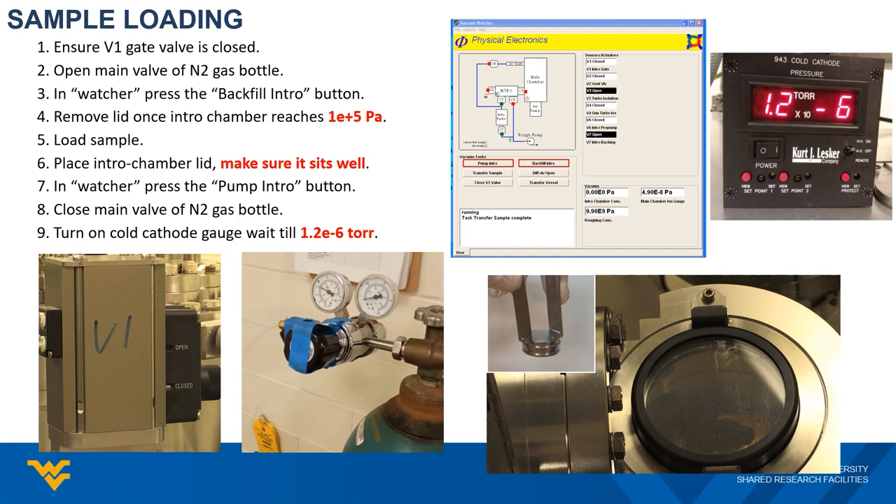Next, let's go through the sample loading procedure. The basic idea is to open the sample introduction chamber, put your sample in, then seal it and let it pump down. First, check the valve position of the gate valve between the intro chamber and the main chamber. Make sure the valve is physically closed, indicated by the white mark. You do not want to accidentally vent the whole chamber if that valve is left open.